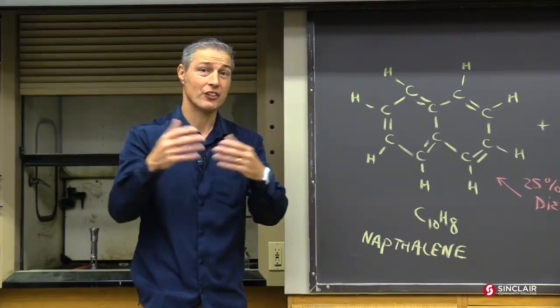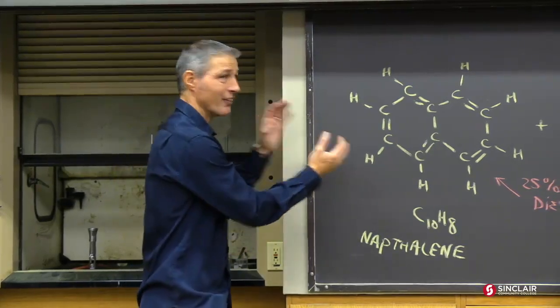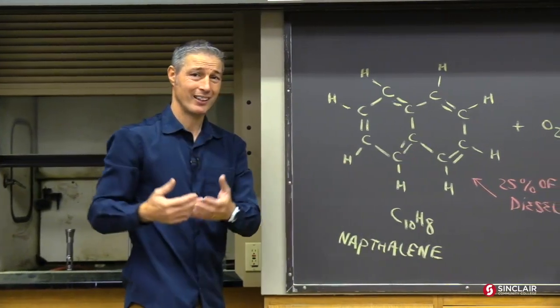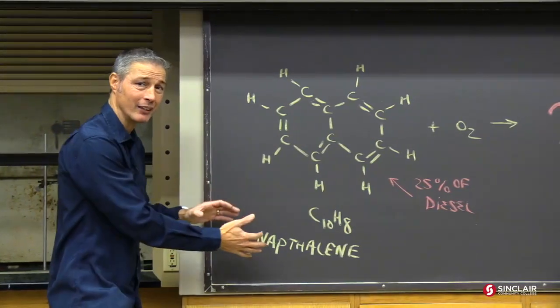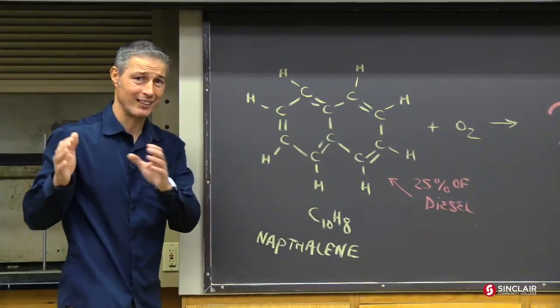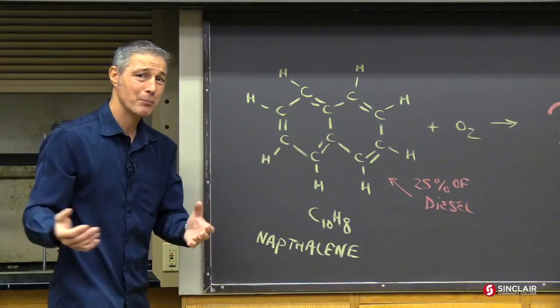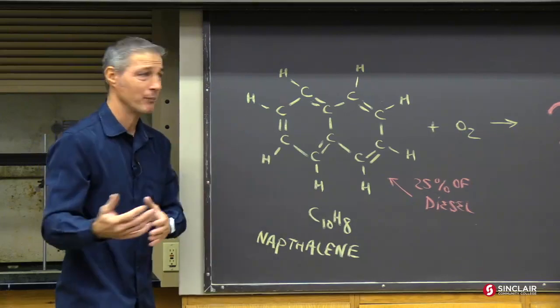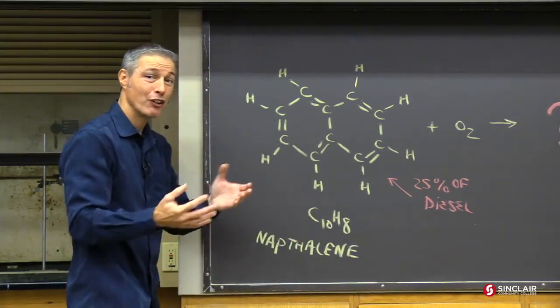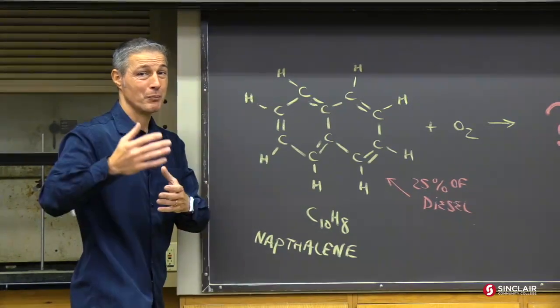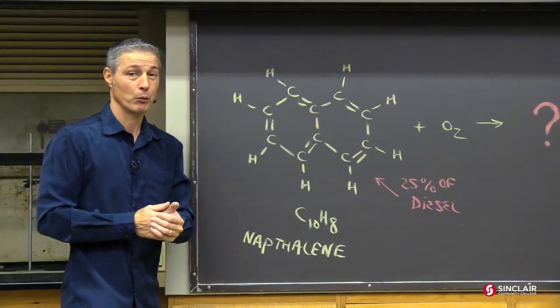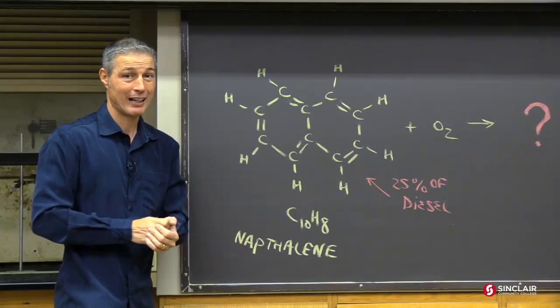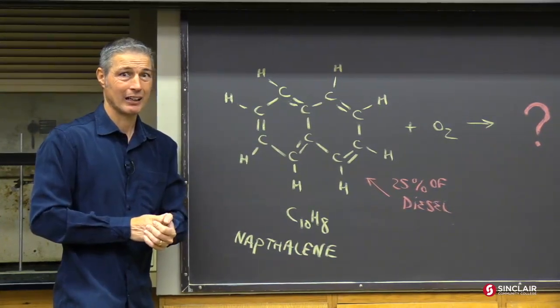Transitional element. Now we're going to burn some hexane, which is saturated. And then we're going to burn this, which isn't even close to possessing a 2 to 1 ratio of carbon to hydrogen. This is naphthalene. And actually 25% of diesel fuel are compounds that are naphthalene or like naphthalene. C10H8. And you don't have enough hydrogen to make water and carbon dioxide. So we'll have to see what we're going to get. But it ain't carbon dioxide. I just gave it away.